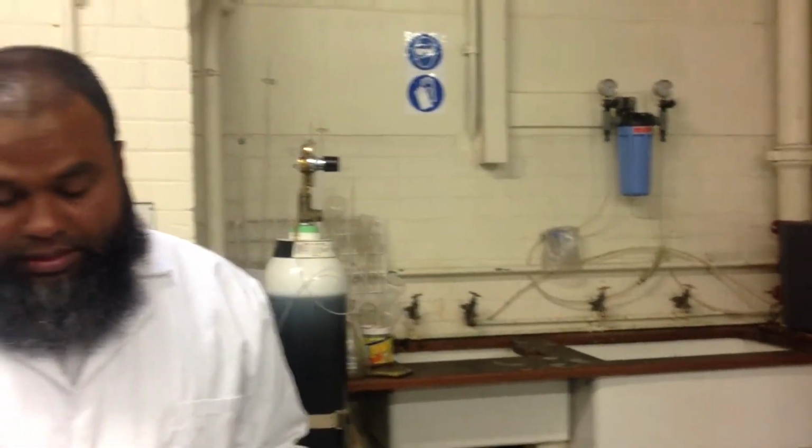If we burn 1 kilogram of fuel in an enclosed container, the energy liberated due to the combustion of that 1 kilogram of fuel is known as the heating value or calorific value of the fuel. How we measure this calorific value and how the machine works, I'll briefly explain first, and then I will show you the step by step procedures.